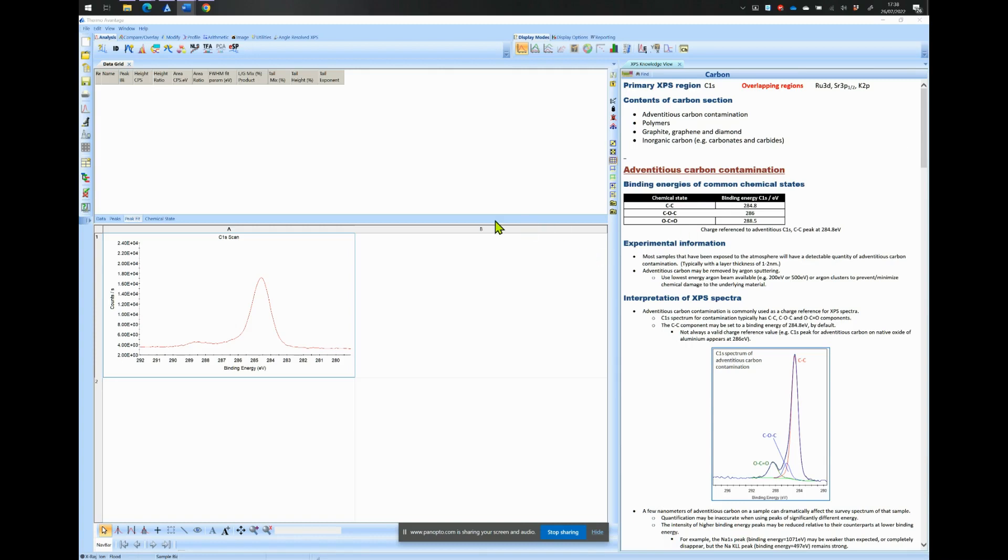This video was created by Wilhelm Cahur from Imperial College London and should not be distributed outside of Imperial College. It is aimed at research students or staff from Imperial College who have never fitted a core level spectrum before. In this video we will use the Avantage software from Thermo.